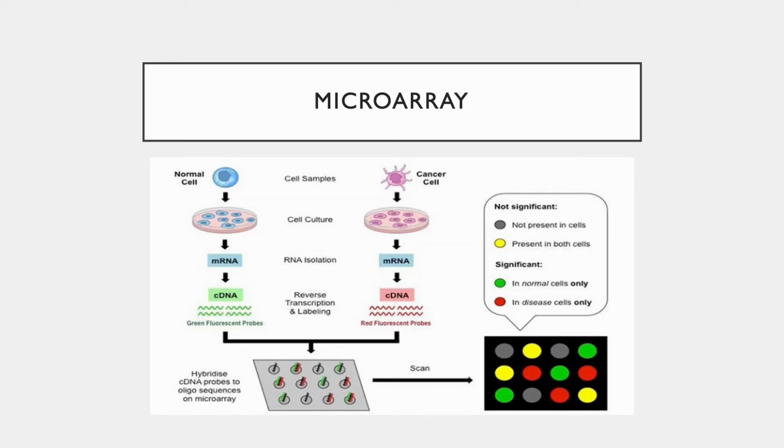Since taking this class, I think we all have a general idea of what a microarray is. In essence, it's just a grid that can hold the genetic material of various biological samples. Each slot or column in a microarray can be organized accordingly to correlate with a certain DNA probe. The strength of the probes binding to the biological samples gives us information about the samples. For example, if a probe for a certain gene binds to a sample, we will observe its fluorescence, and we can conclude that this biological sample can be associated with a certain gene.